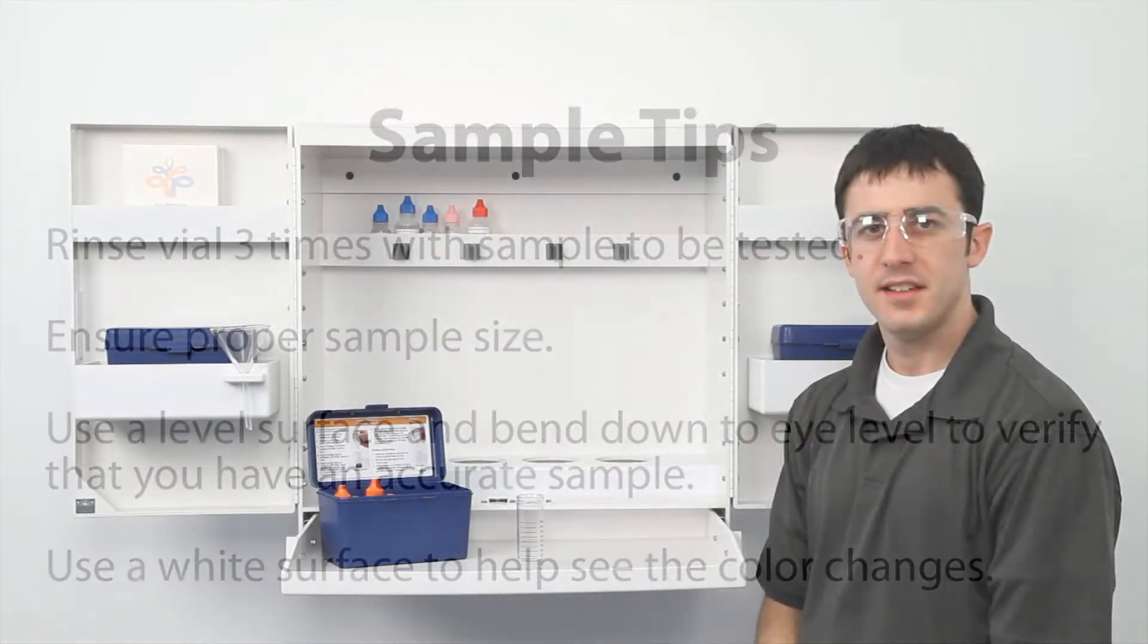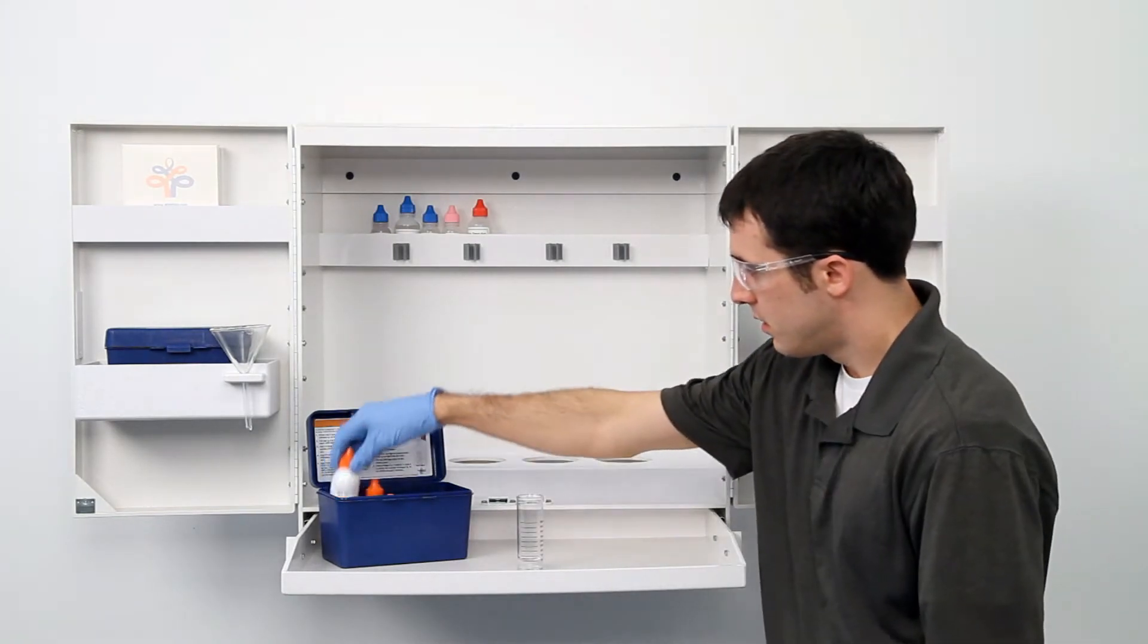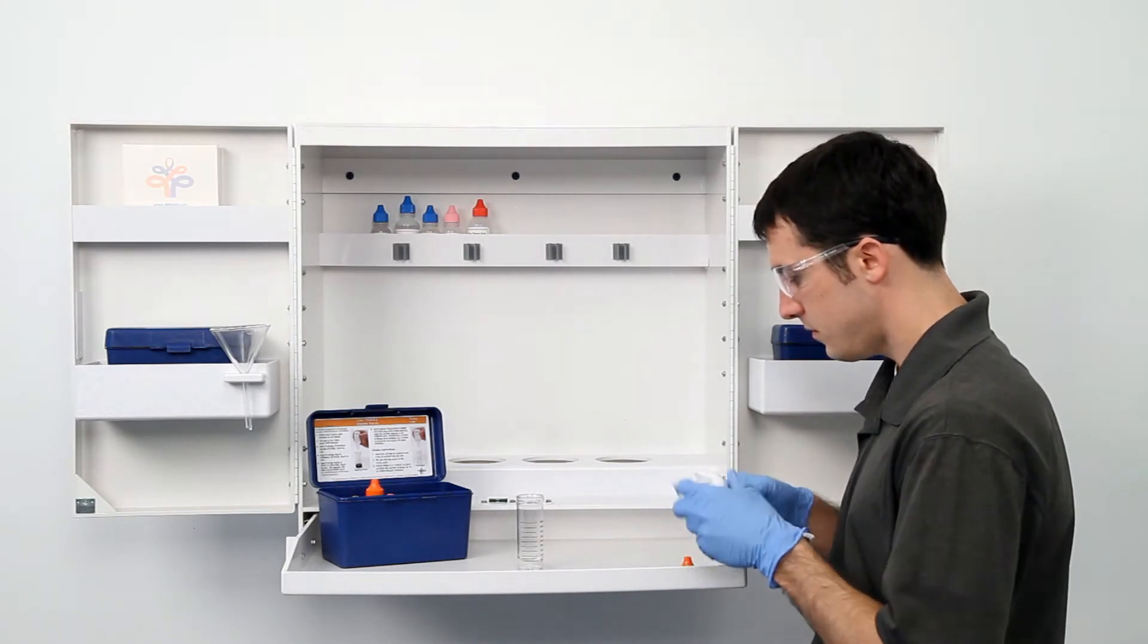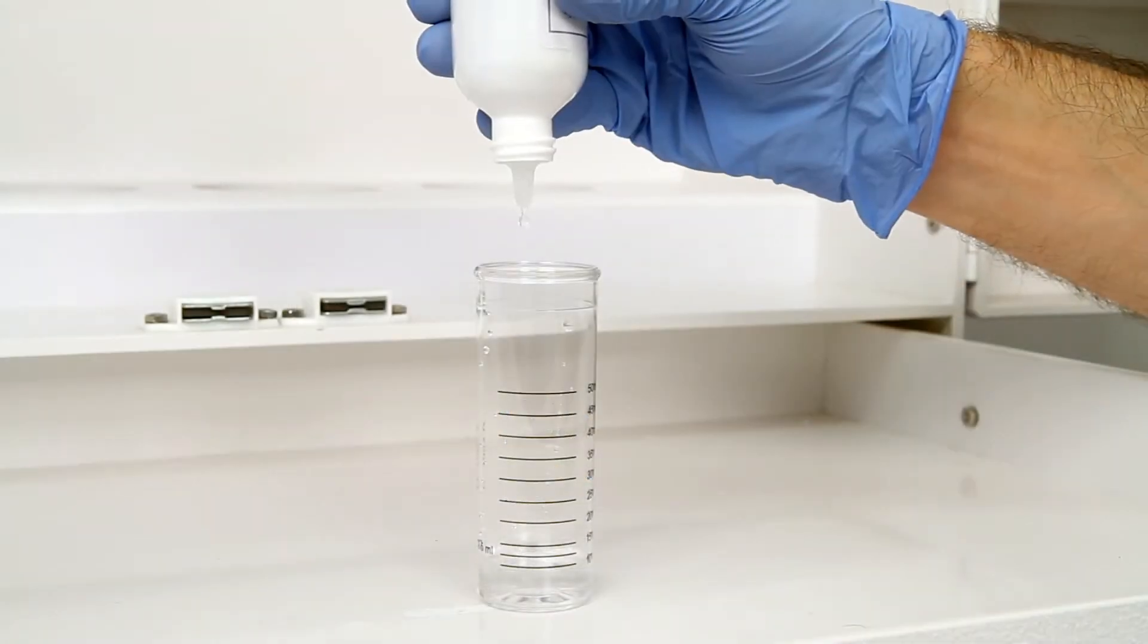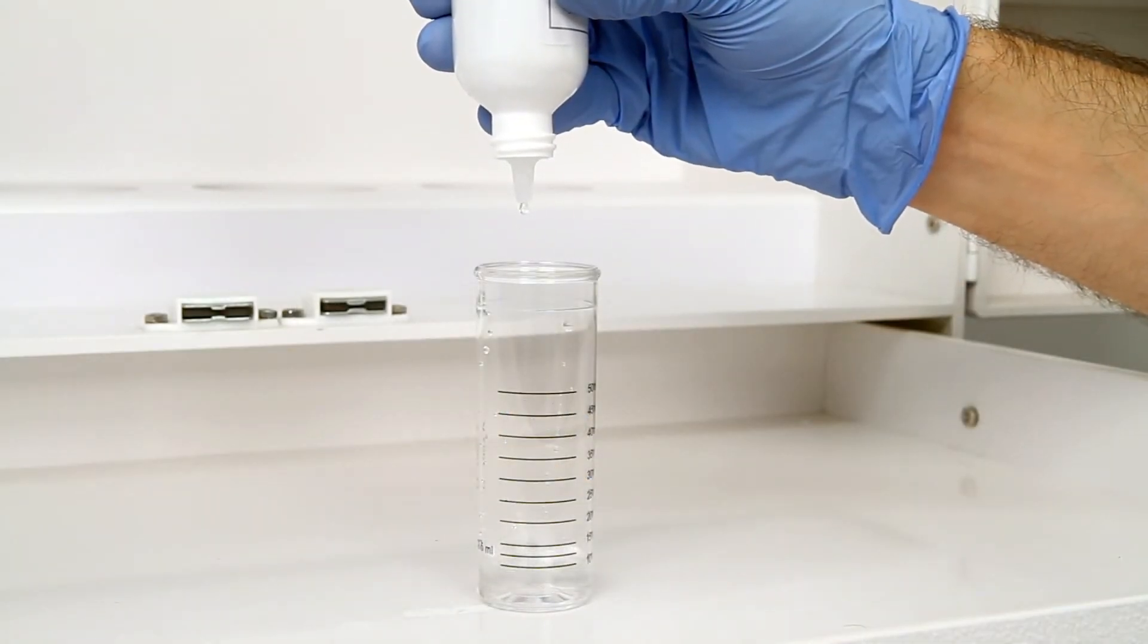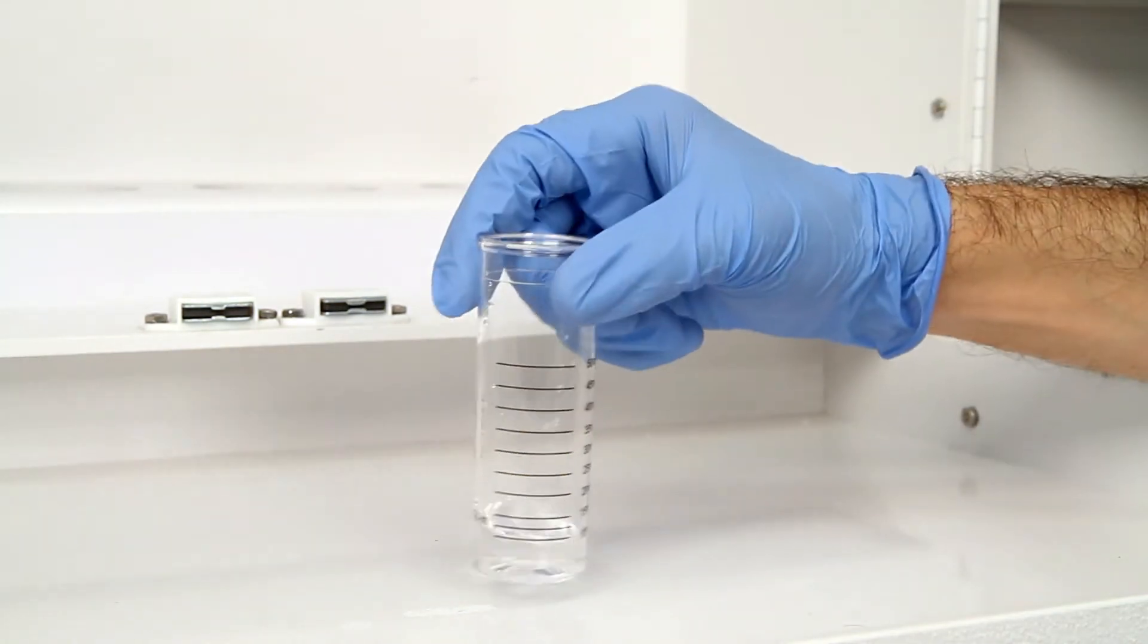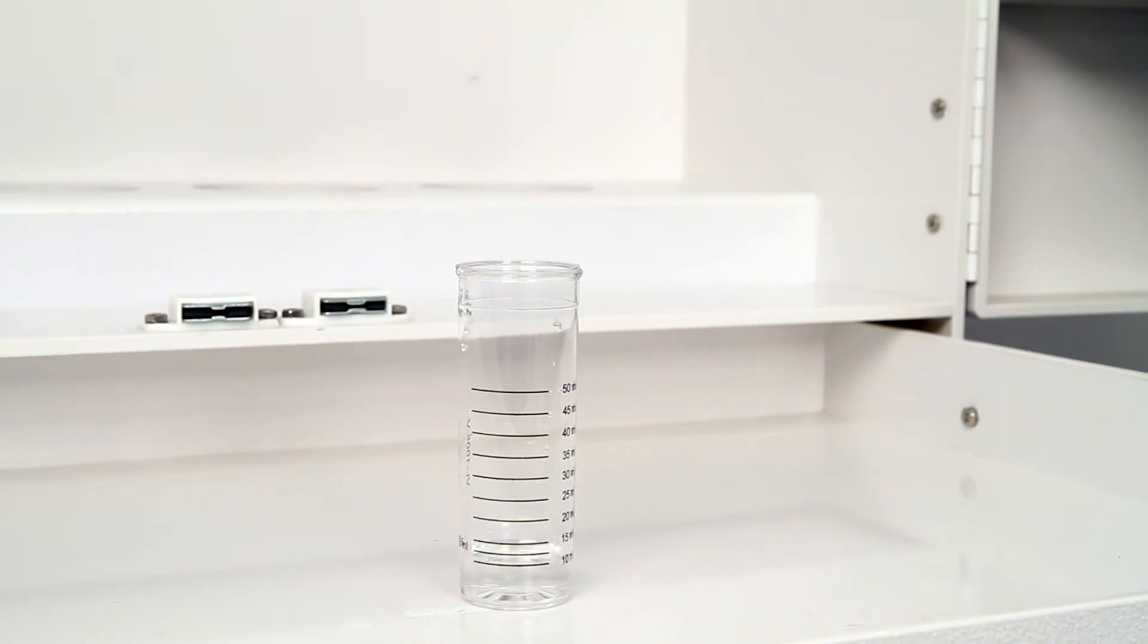Once you have collected an accurate sample, the next step is to add ten drops of potassium iodide. The bottle contains a dropper tip, so it's important to hold the bottle vertically to get a consistent drop size. After the addition of each reagent, swirl the vial for five seconds to make sure the reagents are properly mixed. If the chlorine concentration is high, the sample may turn slightly yellow at this point.